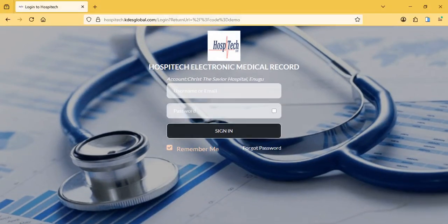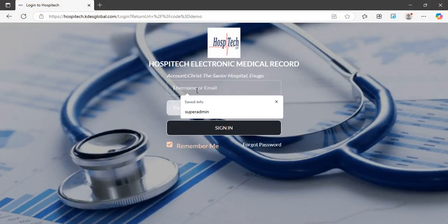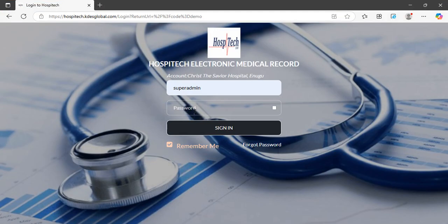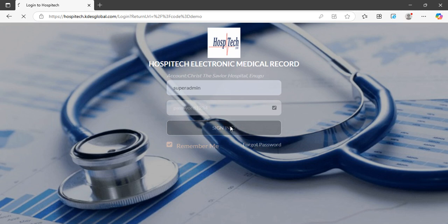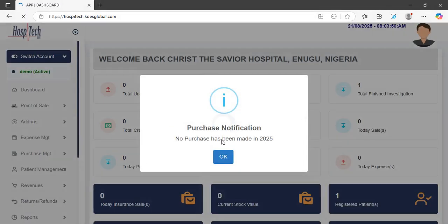So you can see this is Firefox and this is Edge. All right, so let's log in. Let's use the Edge for the super admin. The password is password 1234. Let's confirm that. And this is a domain account. So we've logged in the super admin. So this is the super admin account.